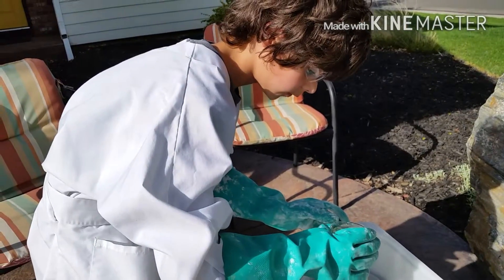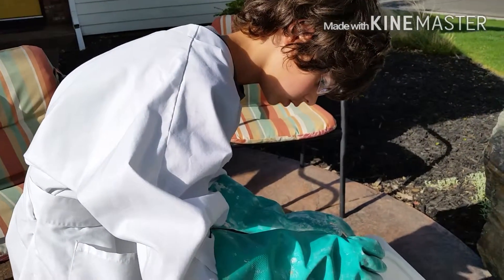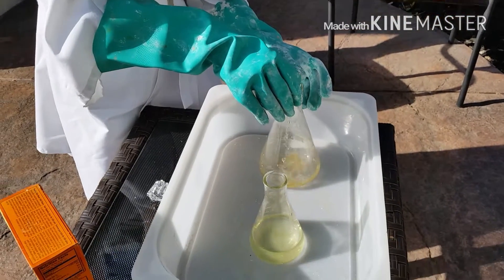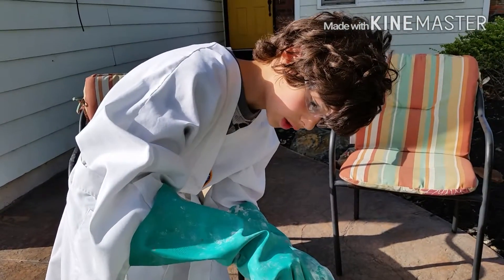We're doing this all over a plastic tub because the acid won't dissolve through the plastic tub, and if you have like a rock counter, it will dissolve through the rock.